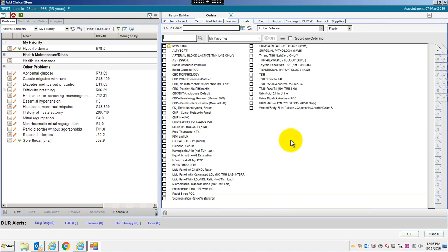Secondly, some sites will choose to receive these pathology results back to a team rather than the ordering provider. This allows for a centralized abnormal pap smear, abnormal pathology tracking system prior to the result being forwarded on then to the ordering provider to do the typical Allscripts results verification process.